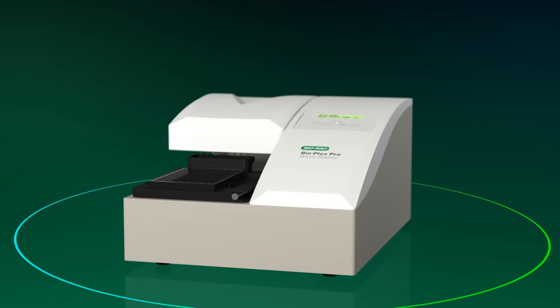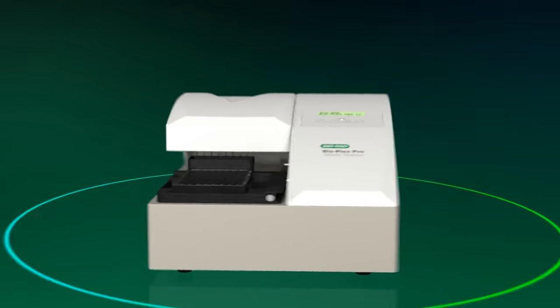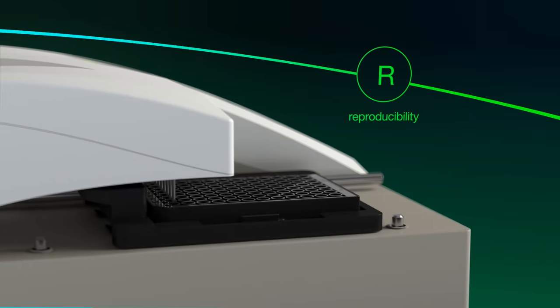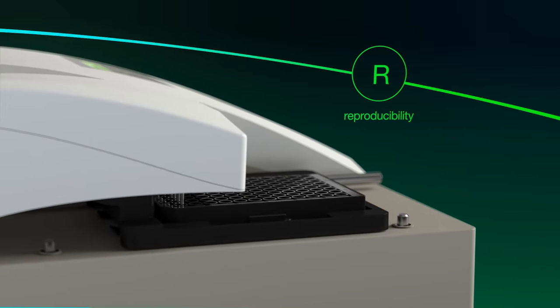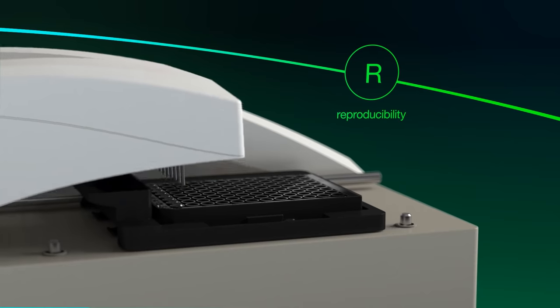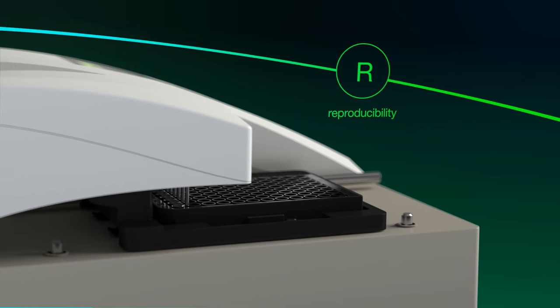Automation increases precision and decreases hands-on time for better results. The BioPlex pro-wash station can be used for every wash step, enabling you to walk away and prepare reagents for the next plate.